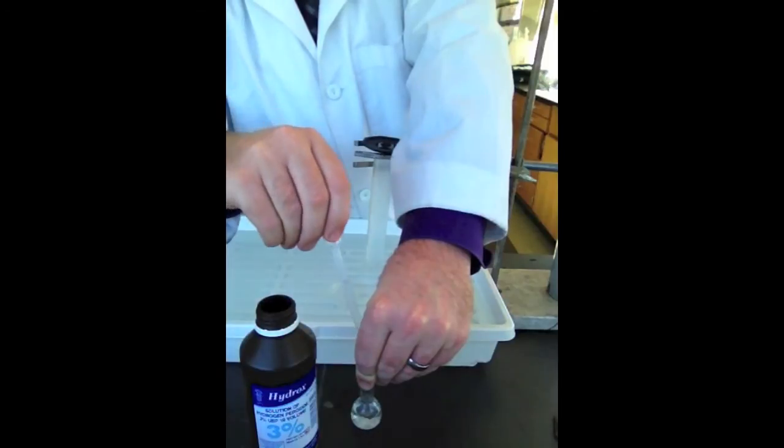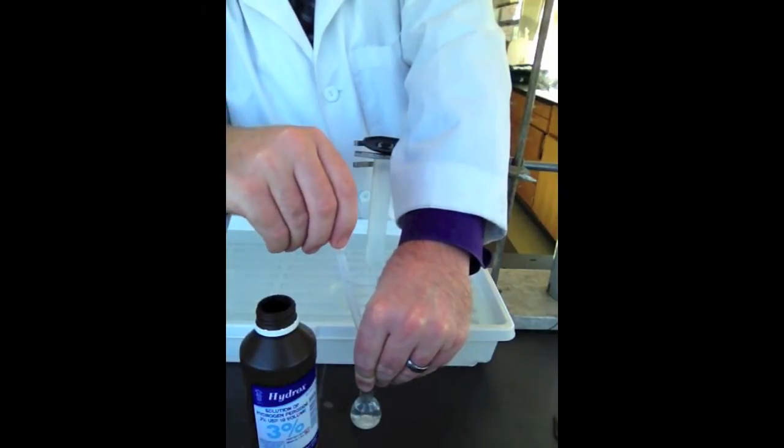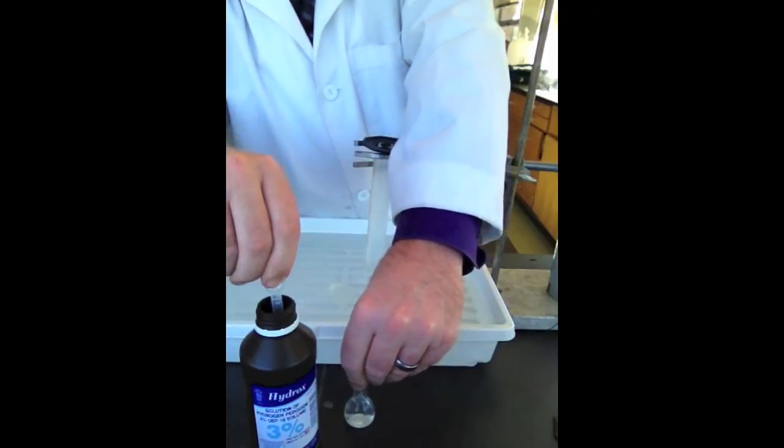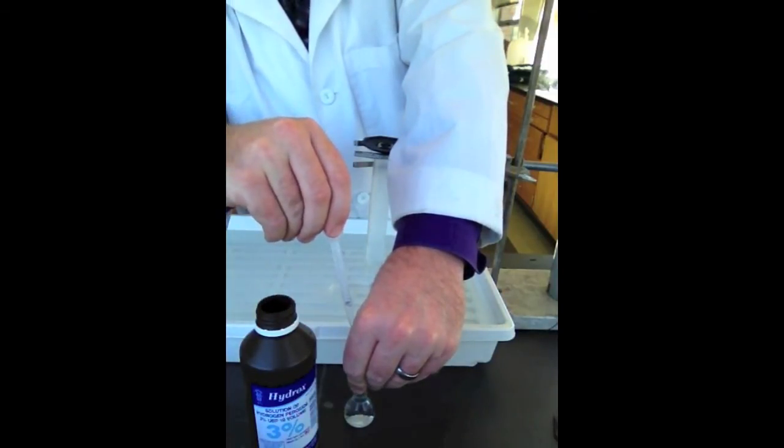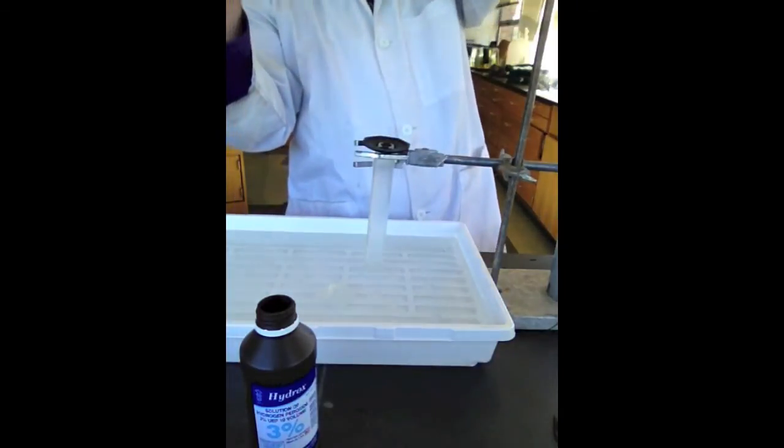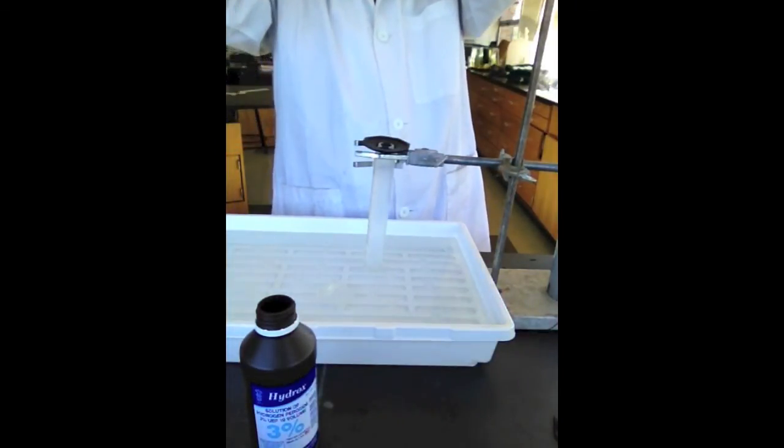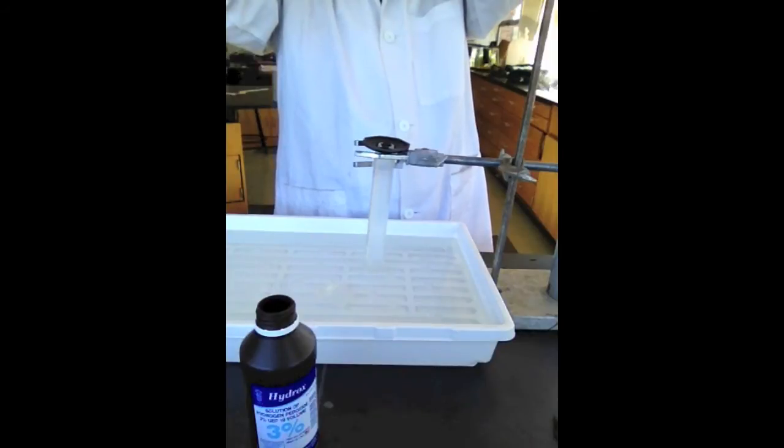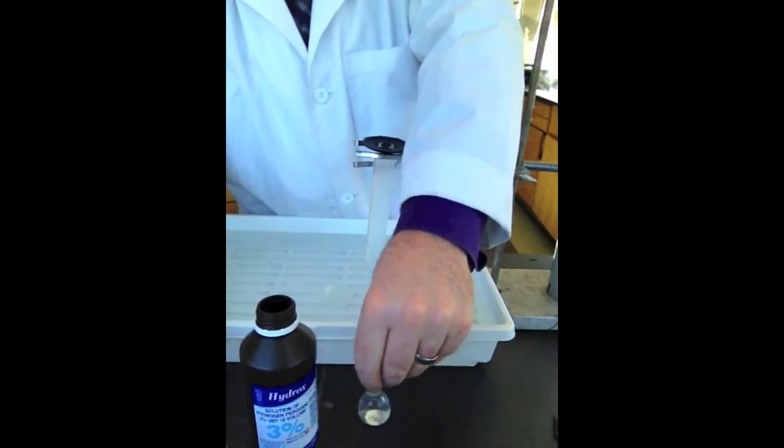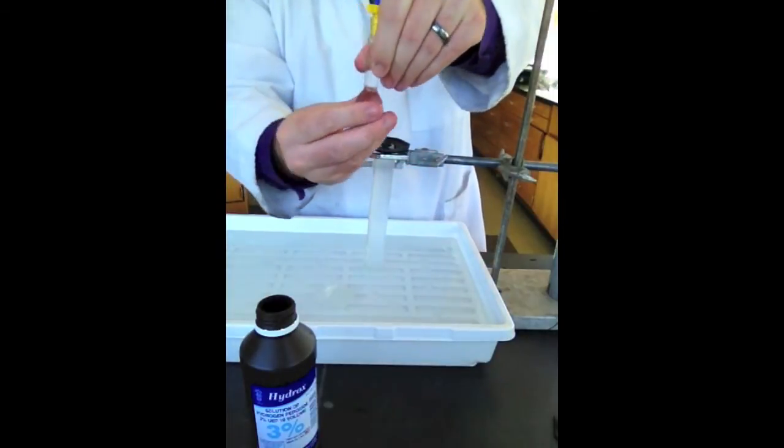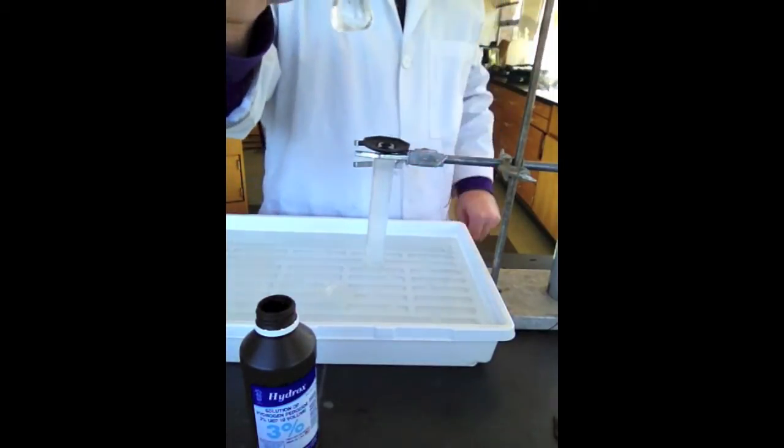Maybe I'll get some bigger pipettes for this, too. All right, that brings it right up to 10 ml. Remember, get the bottom of that meniscus to that white line. And there we go. We have our 10 ml of hydrogen peroxide.